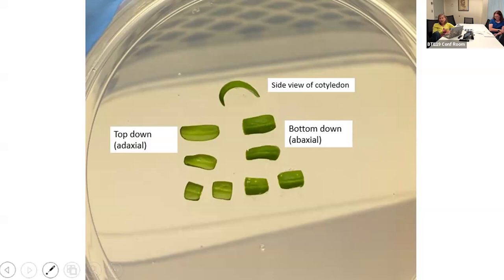I really wanted to do GWAS and look for tomato lines that did not regenerate. We had to screen over 150 before we found 2 that didn't work. So for tomato, we don't need the morphogenic genes. For other systems, like the leaf transformation of maize, they work well, and maybe in other difficult systems they might be worthwhile. But for tomato, which we're discussing today, we don't need them.